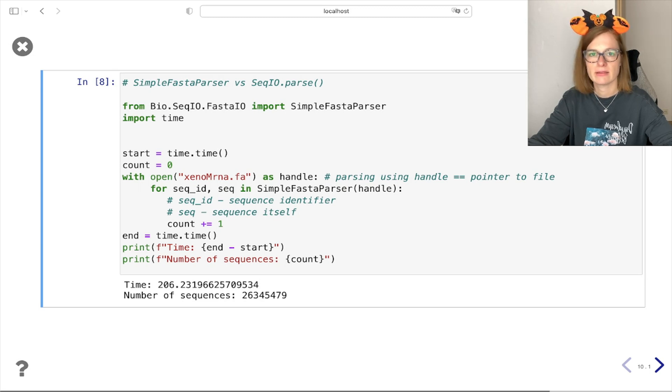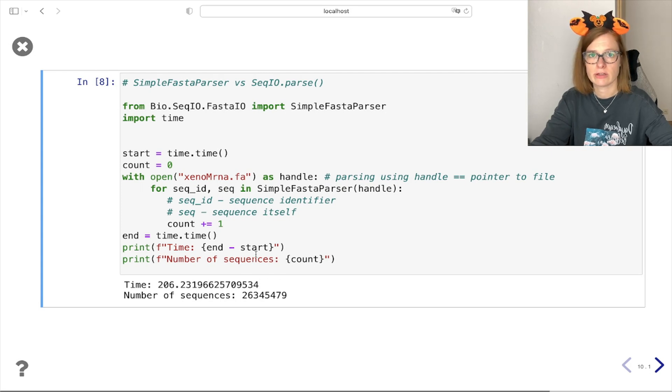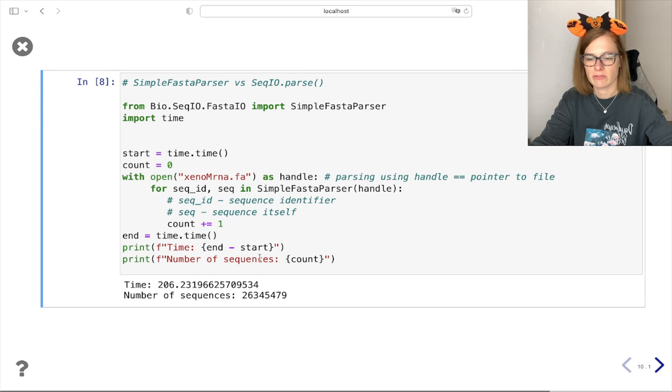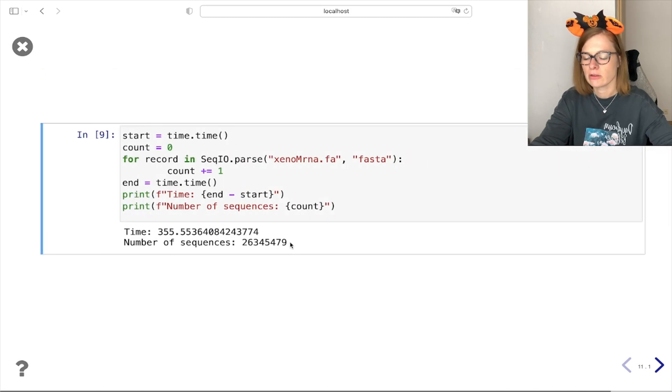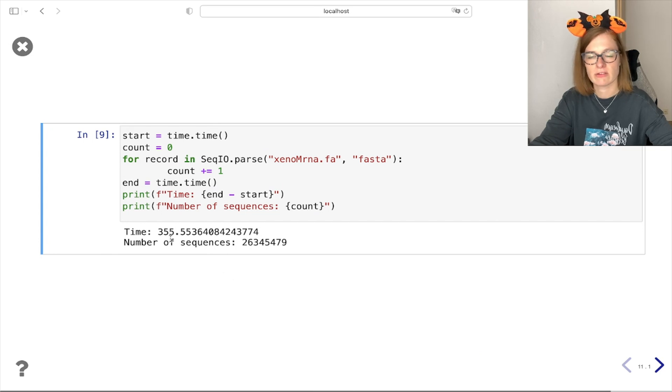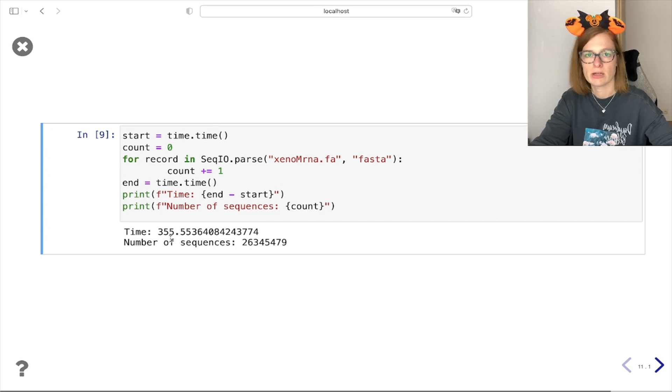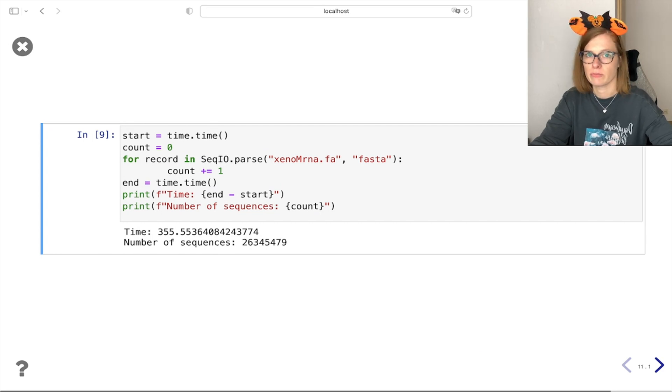We can see that SimpleFastaParser takes around 206 seconds to read all the sequences from our big file, while the parse functionality took around 355 seconds which is almost double the time. So make sure to use SimpleFastaParser when speed is of importance.